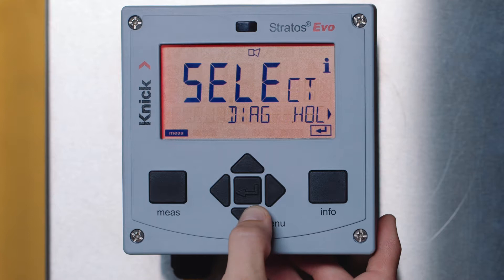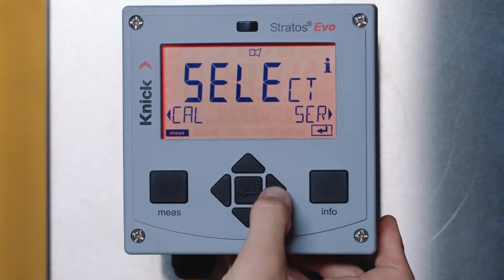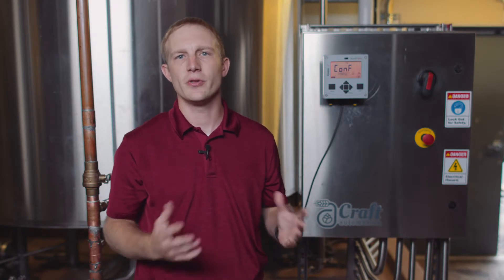First, press the menu button and then toggle to the right to configuration. Pressing enter, you will see the two parameter sets available. This allows you to program each parameter set to different measurement situations. This is useful, for instance, in batch processes which may have different characteristics for each batch being ran. The parameters can then be changed via an external input into the transmitter.